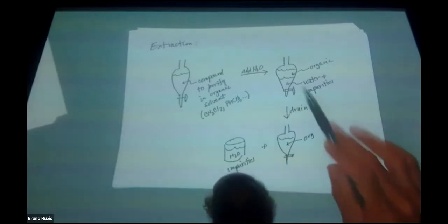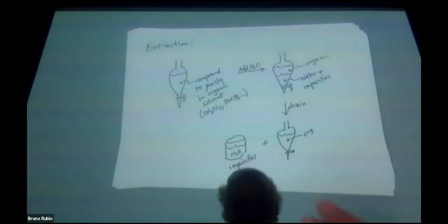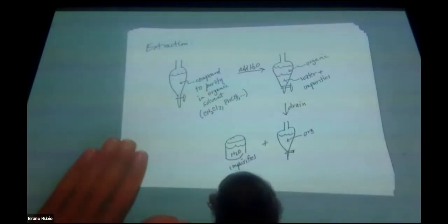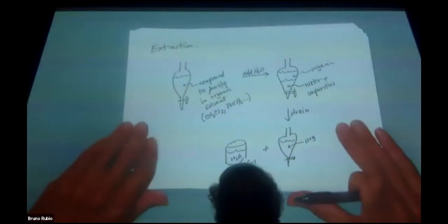But the key here is that these solvents have to be immiscible. Of course, one can't dissolve in the other, or else you won't have these 2 layers, so you won't have the ability to separate these 2 layers from each other.